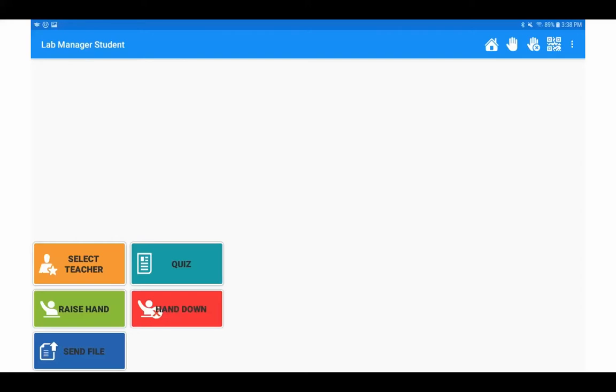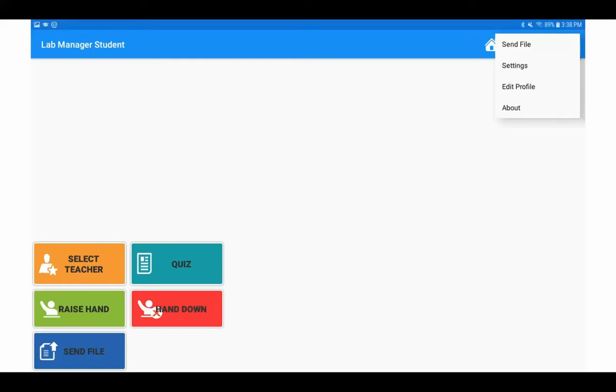This is a video showing how to edit the student profile within the student device for the LX or LXI. When the student has navigated to the Lab Manager software on the student device, they will click on the upper right hand side on the three dot icon and then select edit profile.